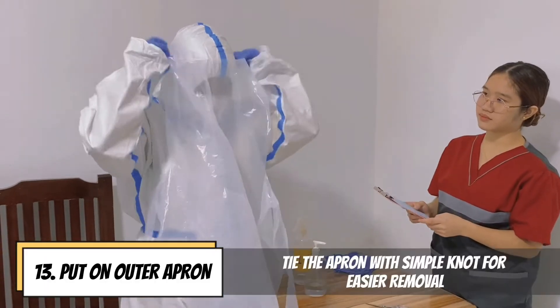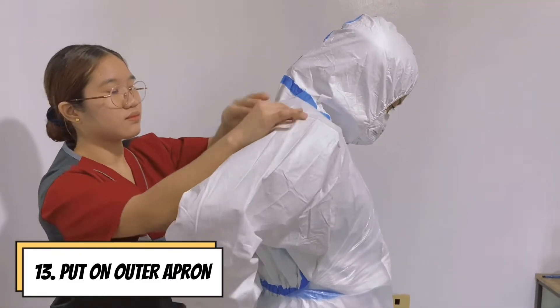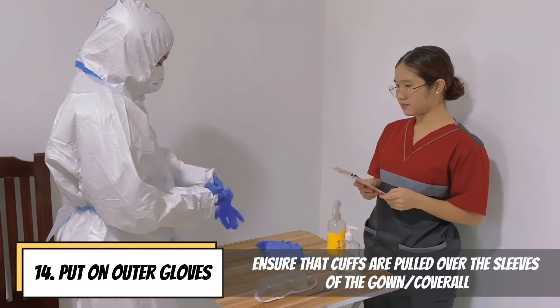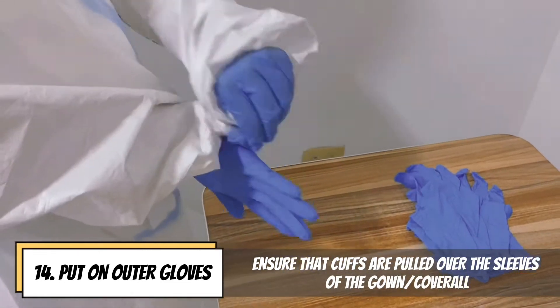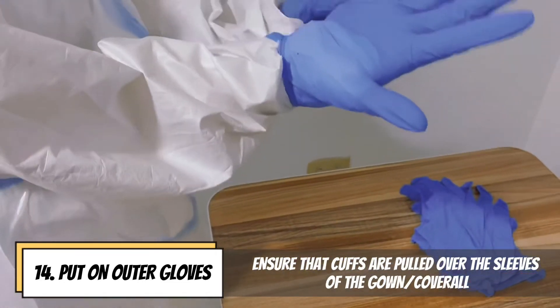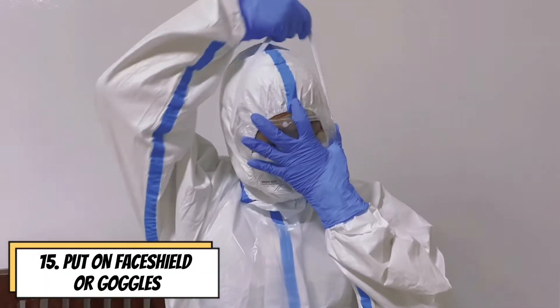Put on outer apron and tie it with a simple knot for easier removal. Put on outer gloves and make sure that the cuffs are pulled over the sleeves of the gown or the coverall. Put on face shield or goggles.